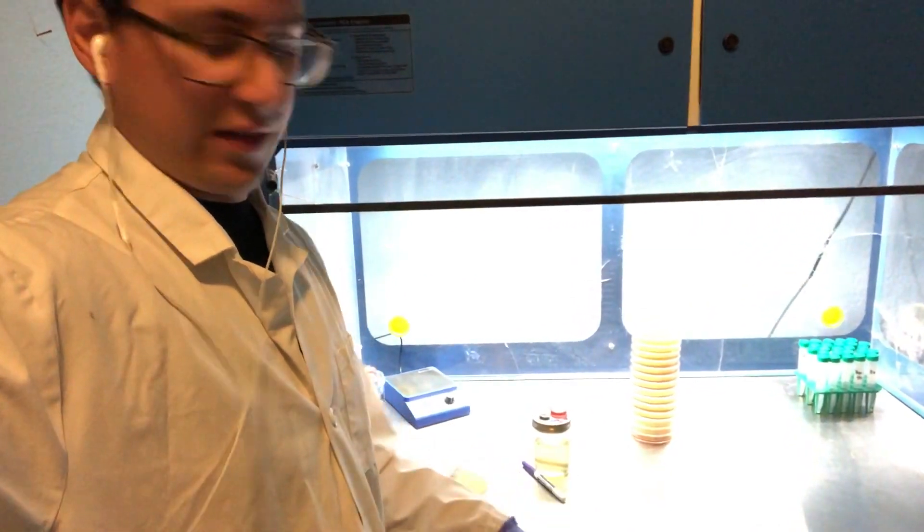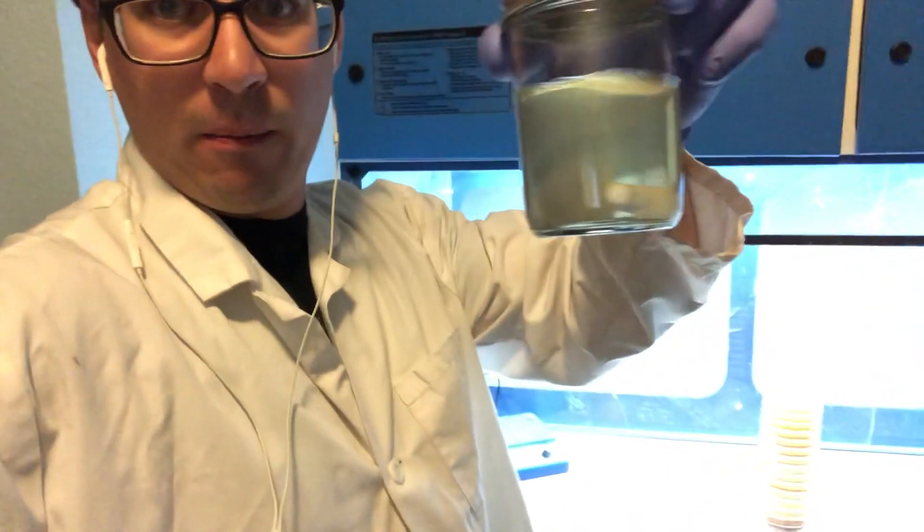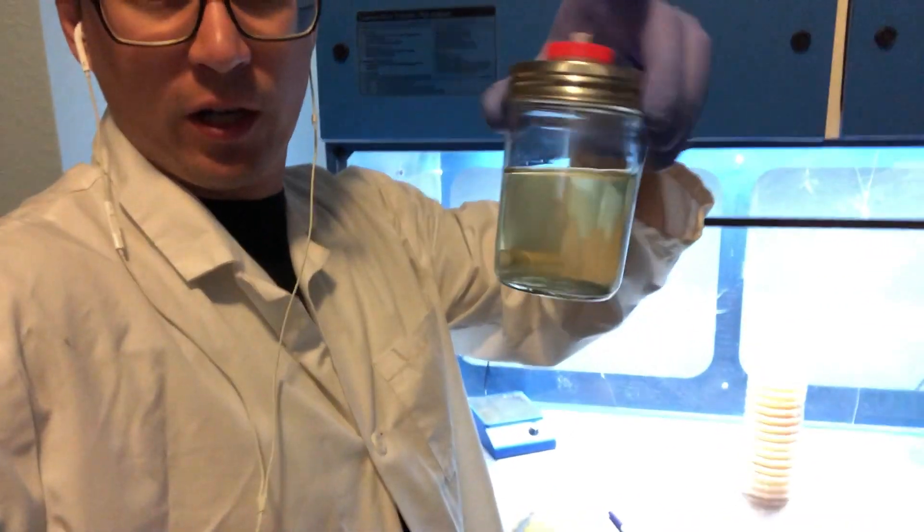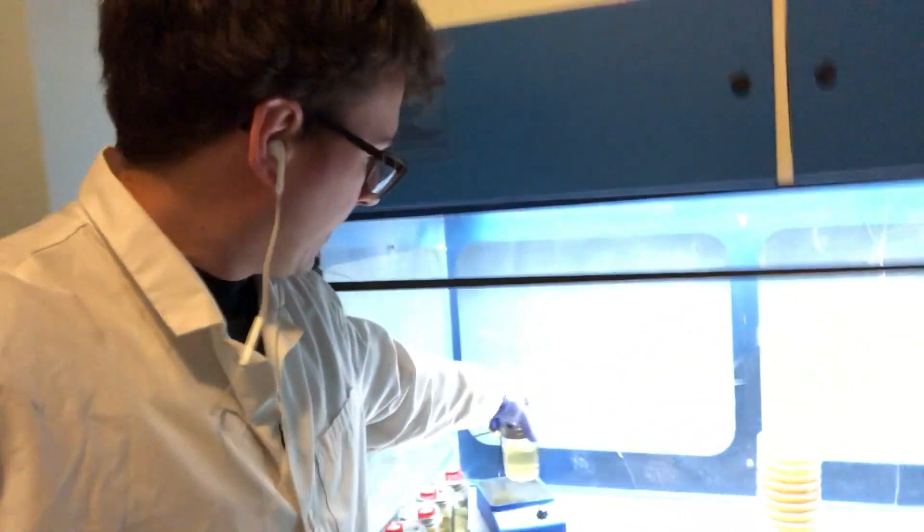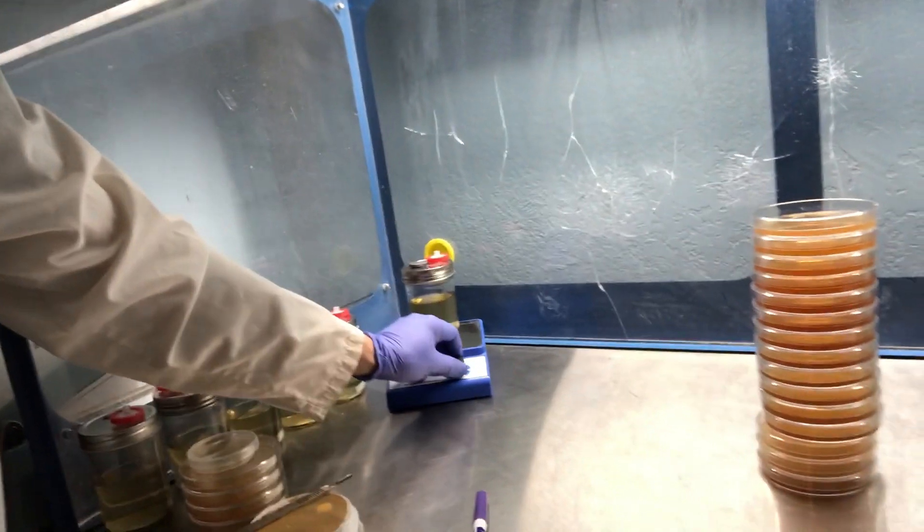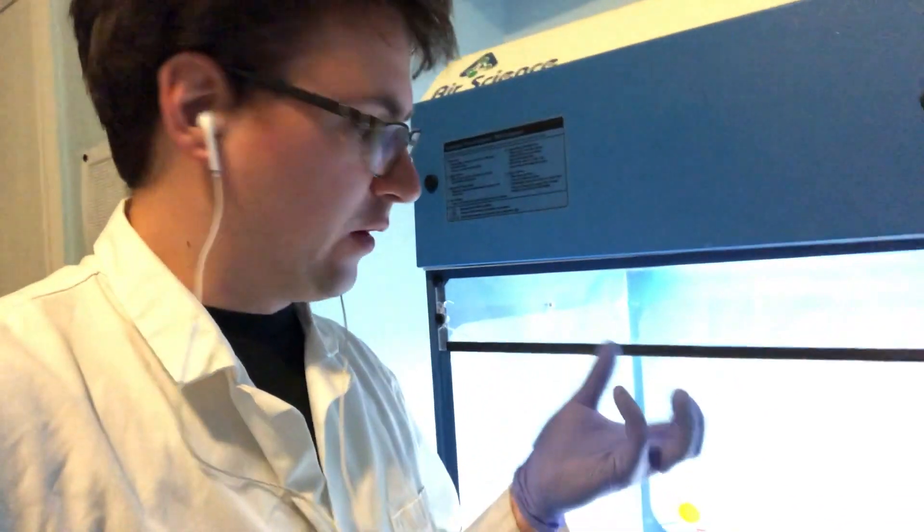Alright guys, so I've got my liquid culture here. It's a multi-spore liquid culture. This came from spore solution that have been diluted out 4 times. I'm just going to go ahead and place this on the stir plate here and let it mix around for about 72 hours. And then as those spores germinate they should collide with each other and form clamp connections.